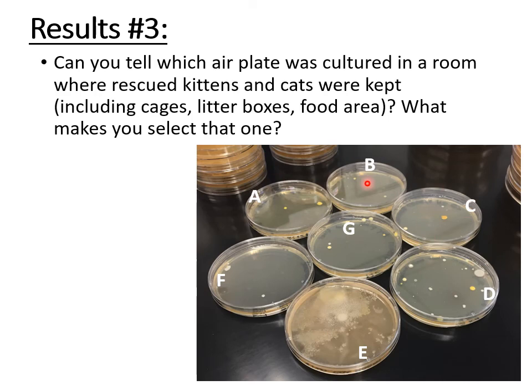And the way you interpret plates is you look for growth. The clear beige, that's the agar itself, and then you look to see, are there spots, speckles, fluffy growth, which we just mentioned, a change in any color, okay, to try and see what kind of growth you're seeing. Okay, again, this is just to see where your logic is, kind of have you doing a little thinking before we get to the real experiments in later weeks.